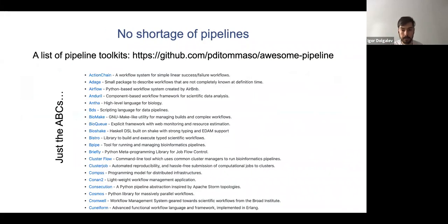And then another step is pipelines. So what is a pipeline? That word is actually frequently abused in our field, or in biology in general. What defines a pipeline? Some people just call a simple script a pipeline.